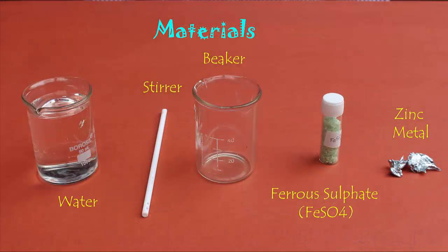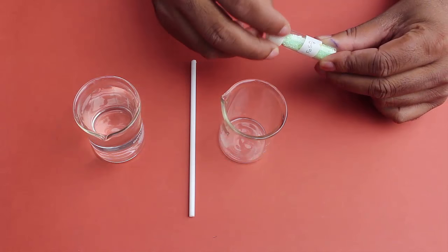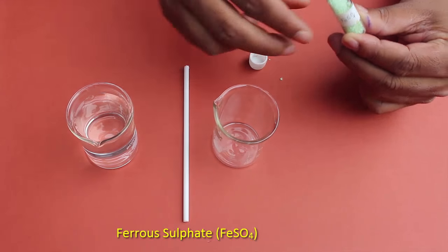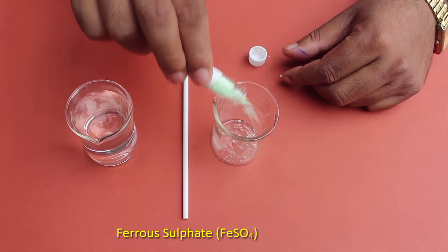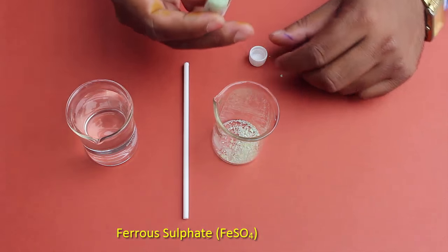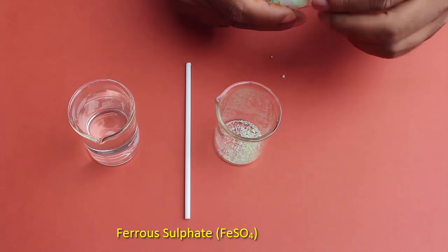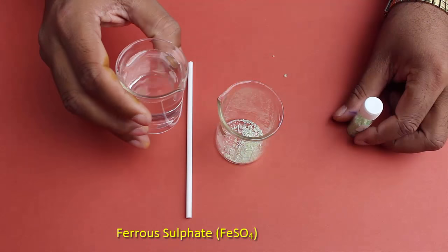Now we are going to prepare a solution of ferrous sulphate. So for this we are taking these crystals of ferrous sulphate into a beaker. Like this we are adding the ferrous sulphate into the beaker. Now adding some water to the beaker.